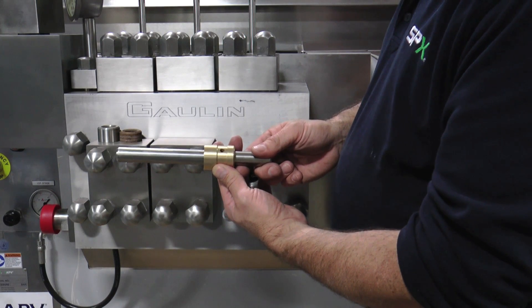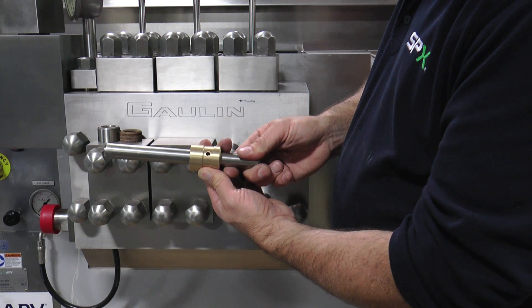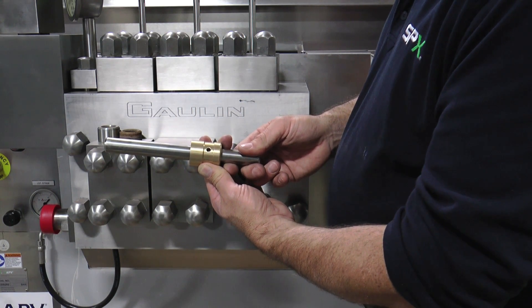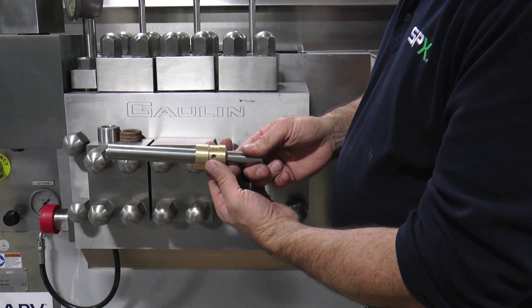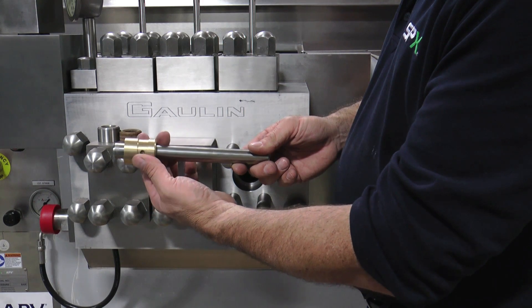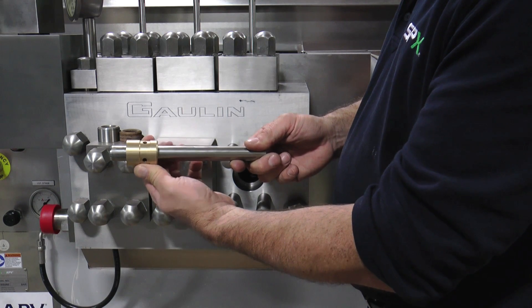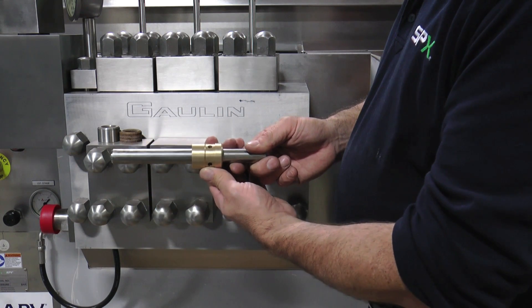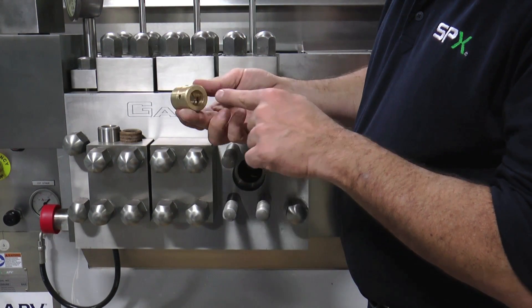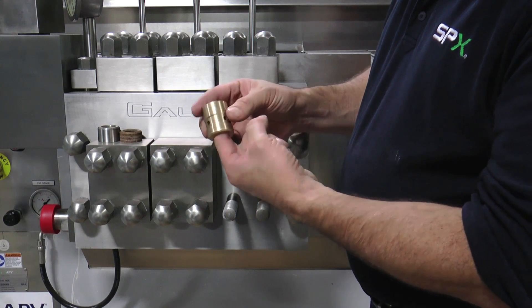Position the ring to the other end of the plunger where there would not typically be any wear. Rock it again. If the amount of rocking is the same in both positions, both parts are good. If it rocks significantly in the area where the packing rides but only slightly on the other end, you would need to replace the plunger. If it rocks significantly in all positions on the plunger, the packing adjusting ring would need to be replaced. Check the inside of the packing adjustment ring for any burrs or scoring and confirm that the part is in good shape.